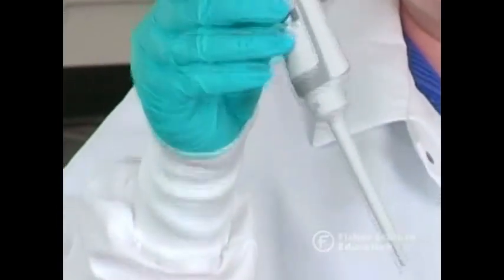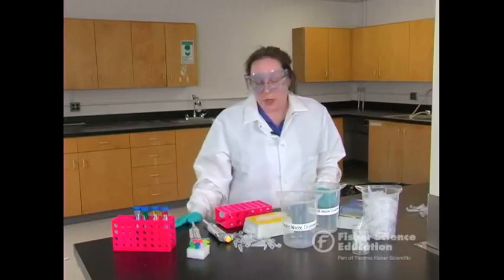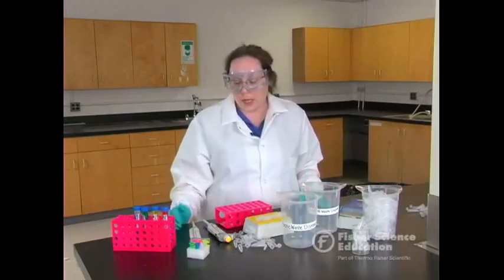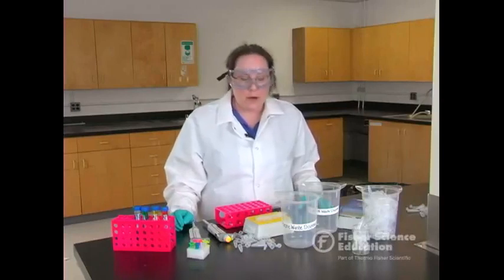They're used in research labs, forensic labs, chemistry labs. Any kind of lab in the world is going to use these air displacement pipettes. And so I'm going to show you how they work a little bit, how to use them, talk about some common errors that students may have, and how to fix them.